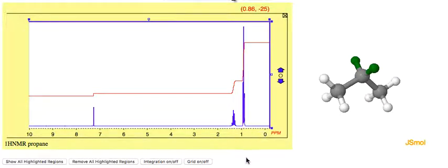The peaks here have structure. So this peak here, very much like in the isopropyl alcohol one from the other video, is being split. This one is the 6 hydrogens from the 2 methyl groups. Only this time it's being split into a triplet here. It's short, tall, short. Okay, and it's being split into a triplet because there are 2 vicinal hydrogens. In that other example, there was only 1 vicinal hydrogen, and there was the OH group. So there's going to be a triplet here instead of that doublet we saw in the other example.